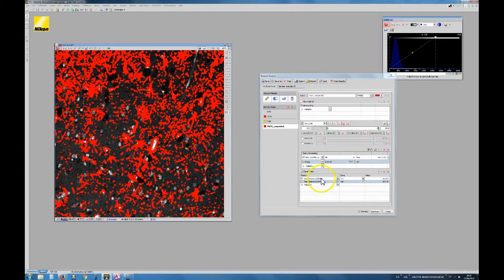I don't really need to save this again, so I'm going to delete them. All I want is to find where the nuclei are. Okay, so I don't need to save anything. I just want to get this mask. Now I have my mask, which is expanded, and then I have the nuclei. And what I can do is combine them. I would like to get only the astrocytes that have a nucleus.